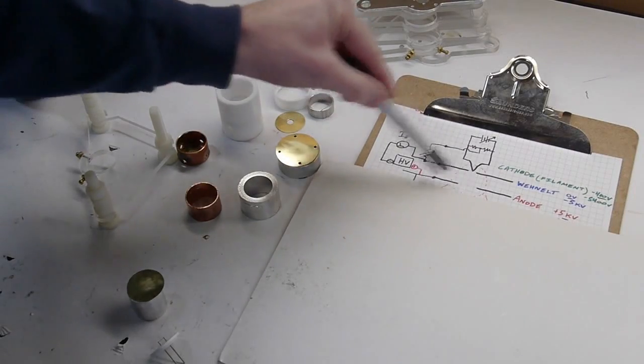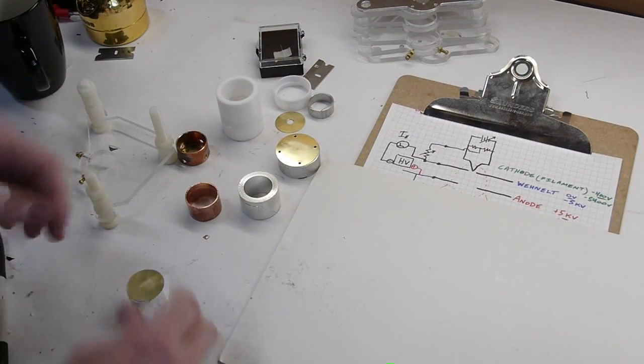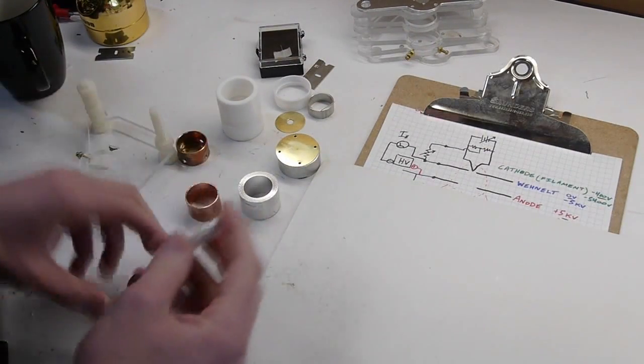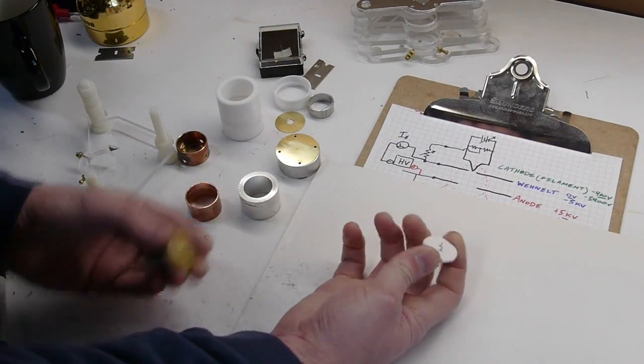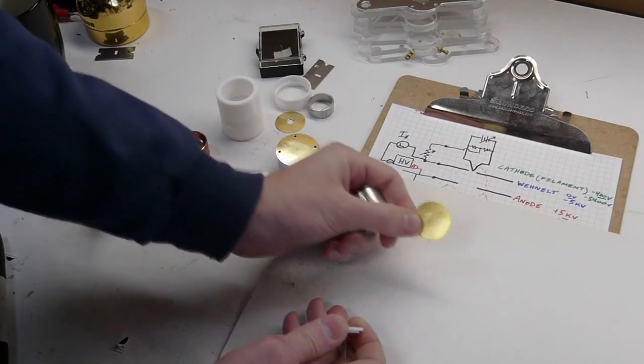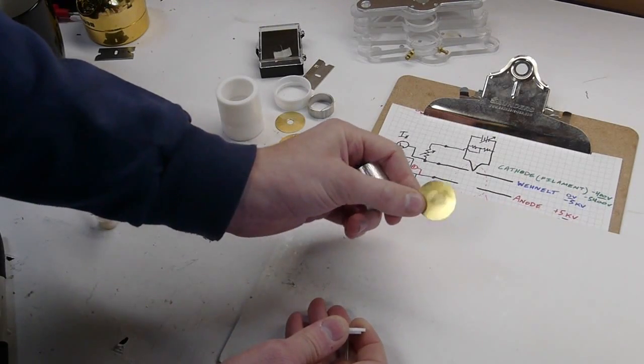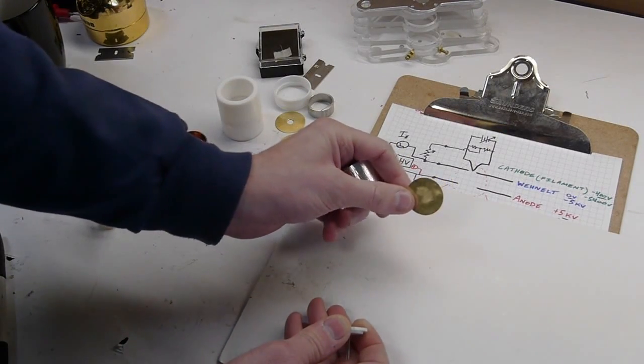So let me put these pieces out here, the actual pieces. This is the filament, the Wenelt cup or Wenelt cylinder. In my case it's just a flat plate with a hole in it, a very small hole.